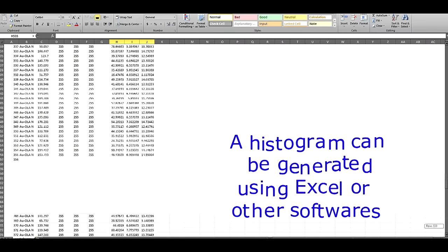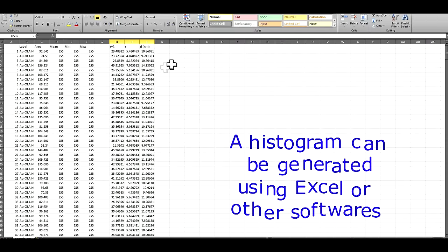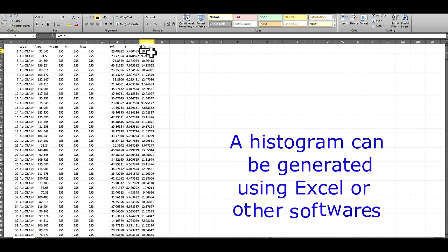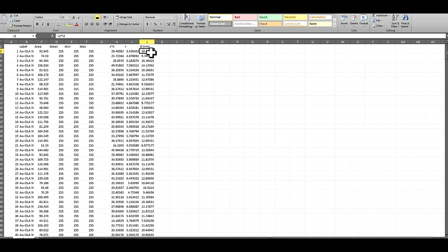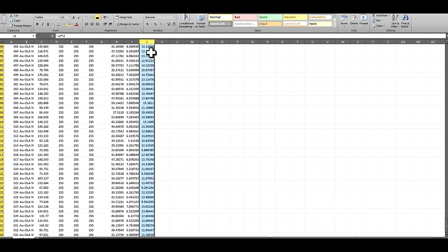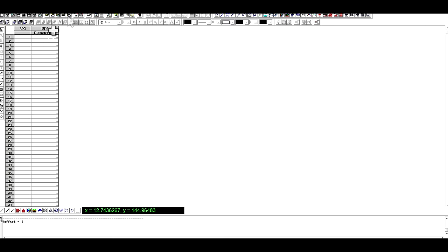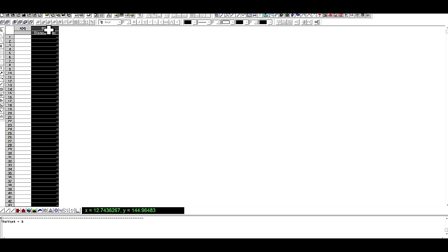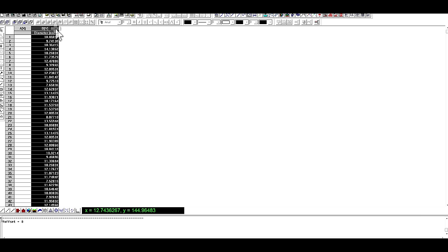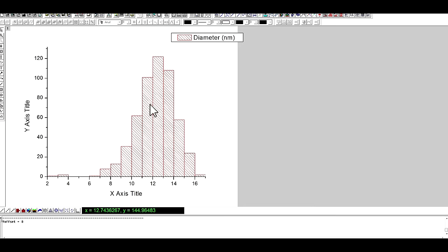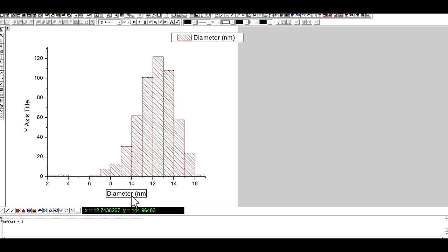Now you can either make a histogram using Excel or you can use other software like Origin. Then make a histogram, so x-axis is diameter, y-axis is frequency.